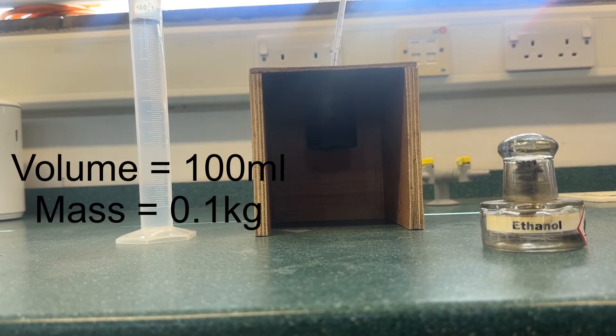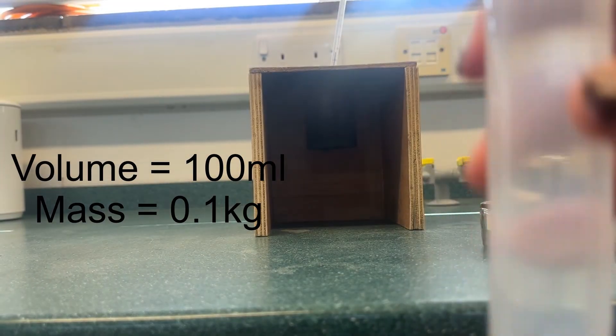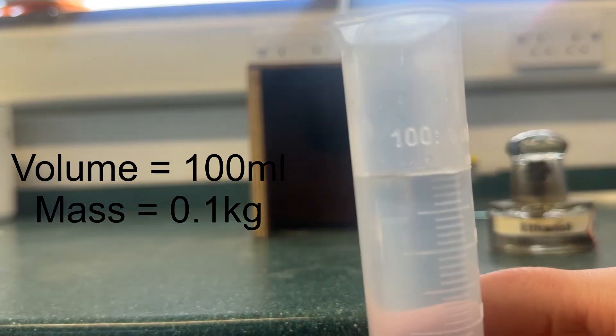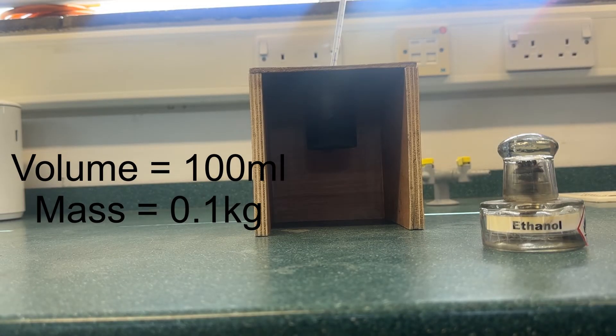After you've done this, you then need to measure out a known volume of water. Here we're going to use 100 millilitres of water. This will be the M in the E equals CM delta T equation. M is in kilograms.